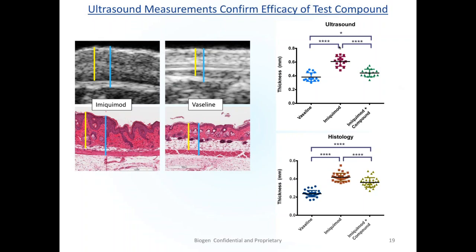Sure. Well, I think our objective was, of course, to use the ultrasound, live imaging, longitudinal, as your primary readout. That was our complete goal. Of course, you want something that we can follow with the therapeutic interventions. There were 2 or 3 other skin models being run in which we didn't end up having a useful measurable signal by ultrasound for various reasons, like the changes just weren't prominent enough to see.